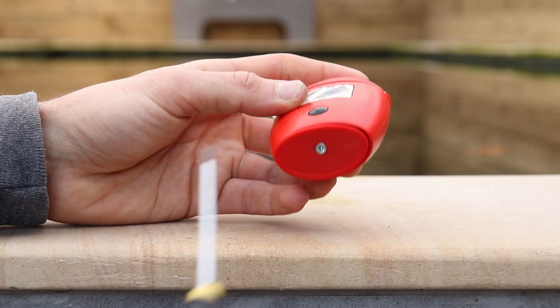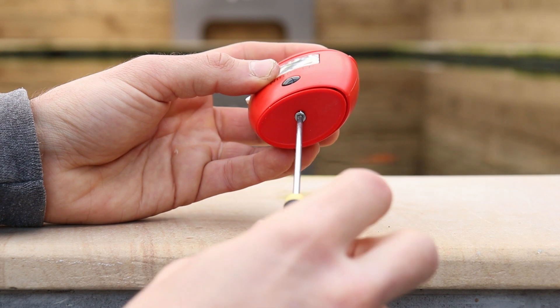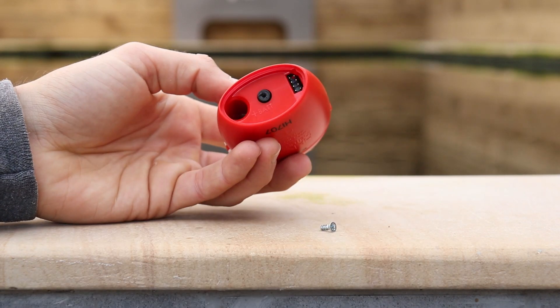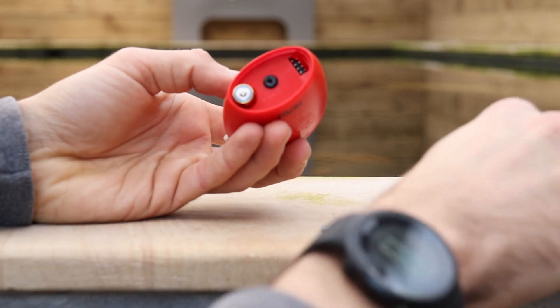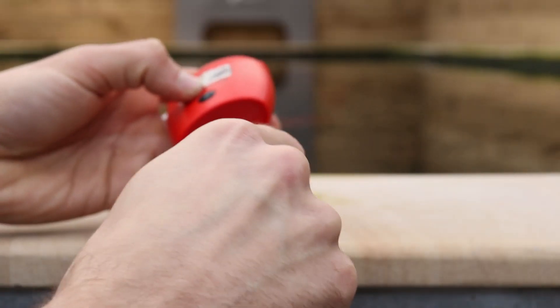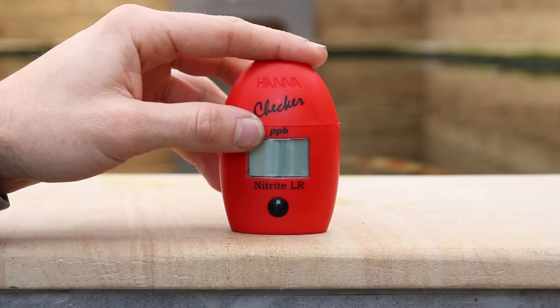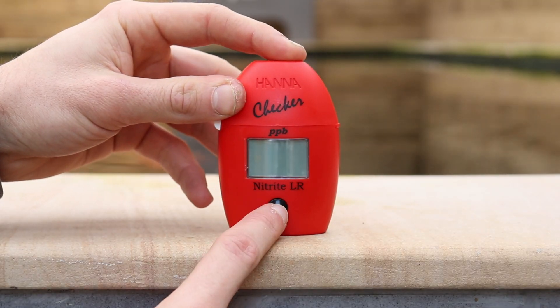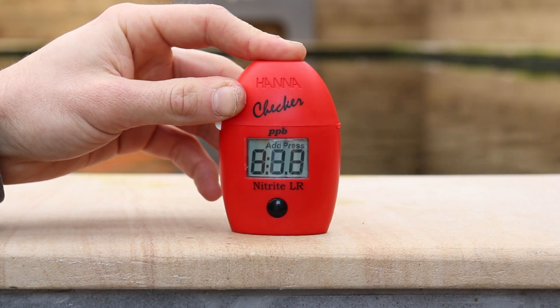First of all we need to put the battery inside the reader. This is done with a small Phillips screwdriver on the bottom of the meter. Once you place your battery inside the pocket checker you can turn it on. This can be done by simply pressing the button once on the front of the meter.